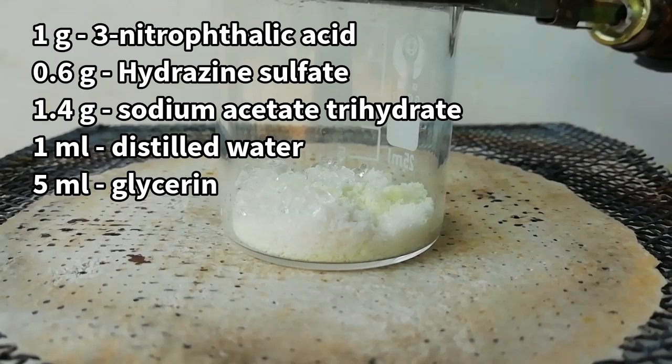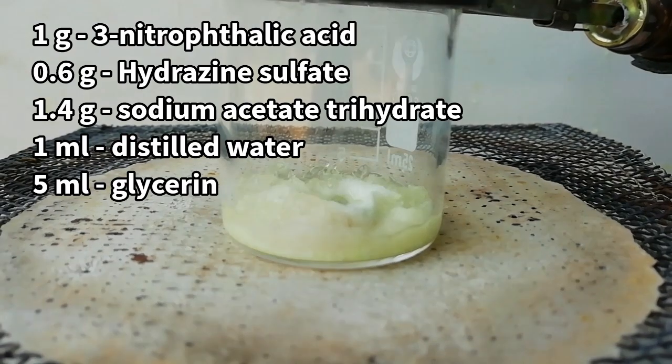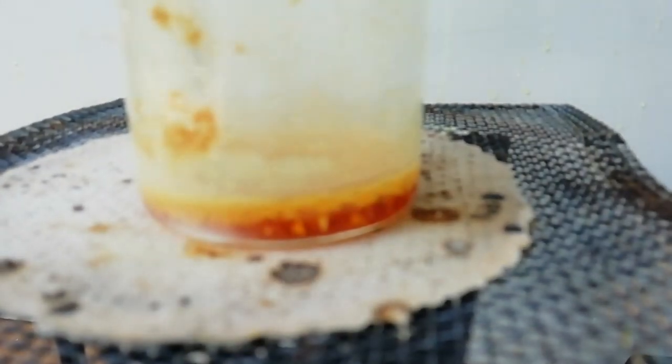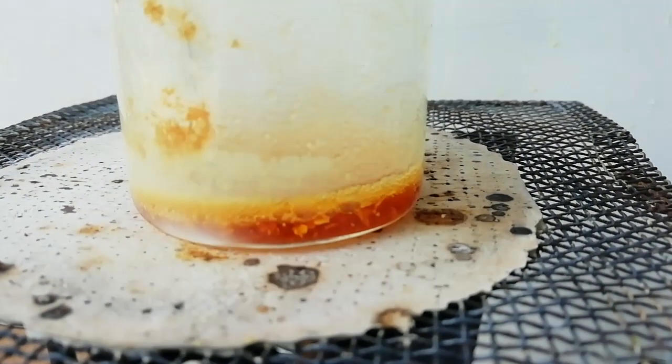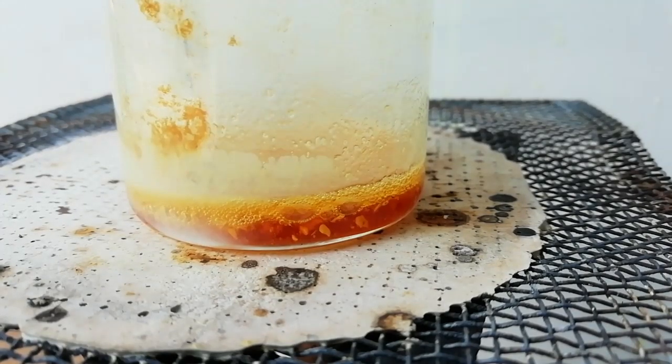First, 1 gram of 3-nitrophthalic acid, 0.6 grams of hydrazine sulfate, and 1.4 grams of sodium acetate trihydrate were added to a beaker. Then 1 ml of distilled water and 5 ml of glycerin were added.